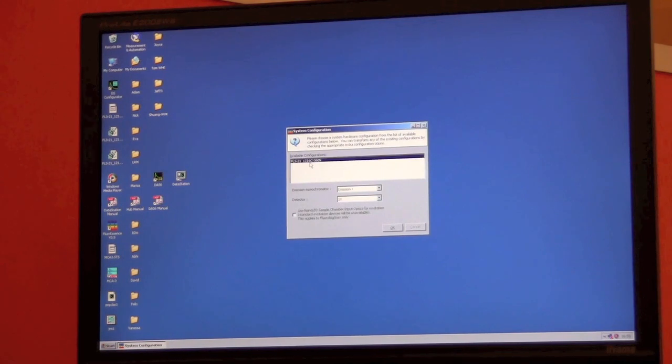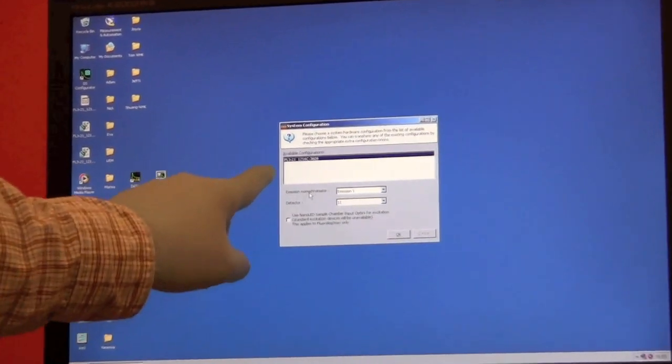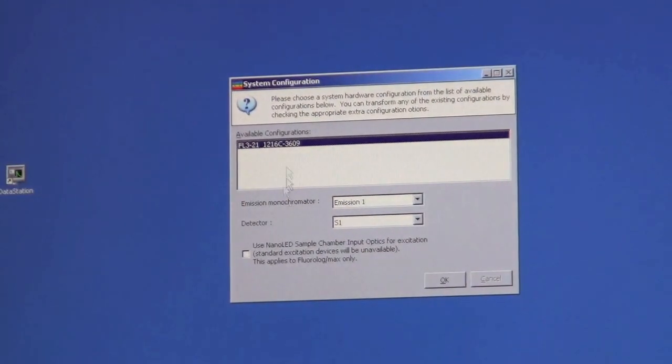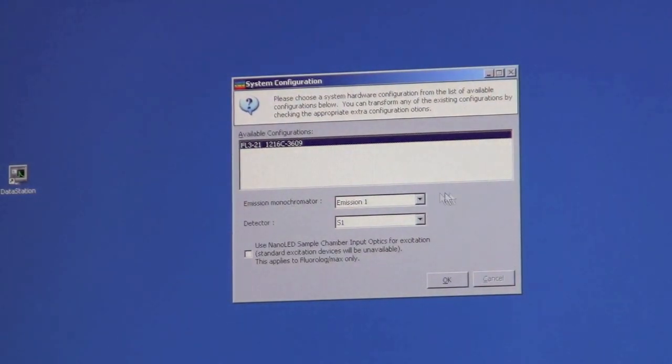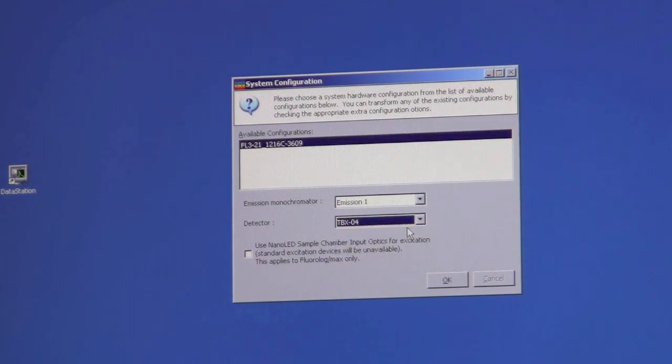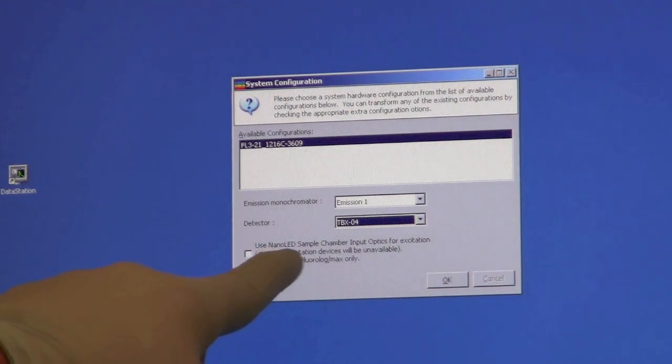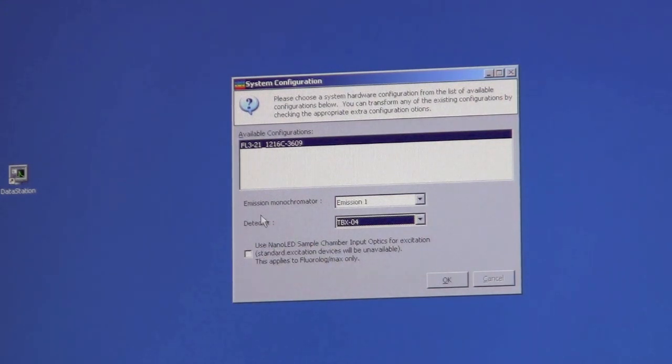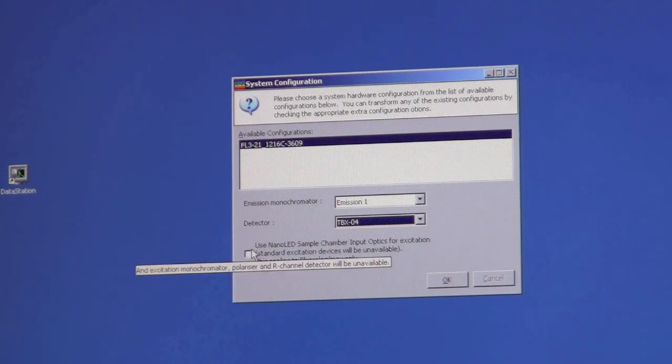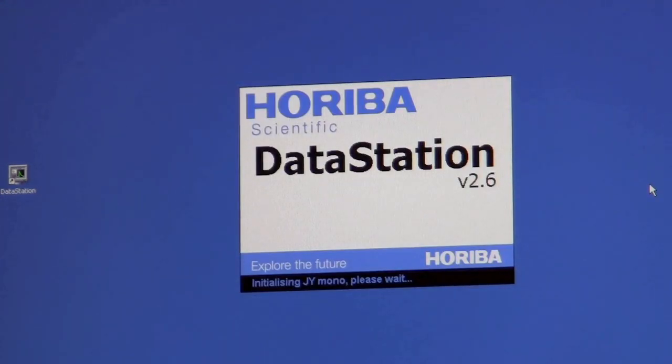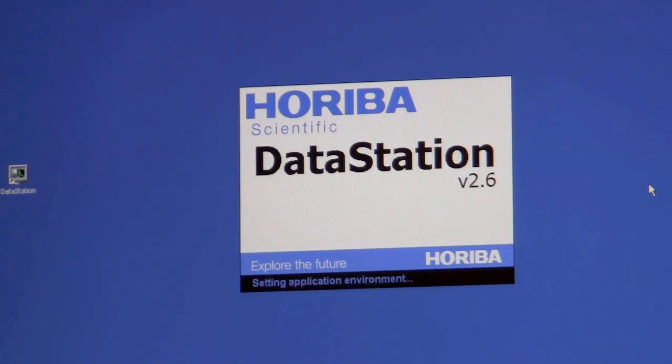To begin, we pick the FL3-21 configuration with Emission 1. The two most important parts are turning to the TBX-04 detector, and using the nano LED sample chamber. We need to click on both of these, and then the instrument will initialize.